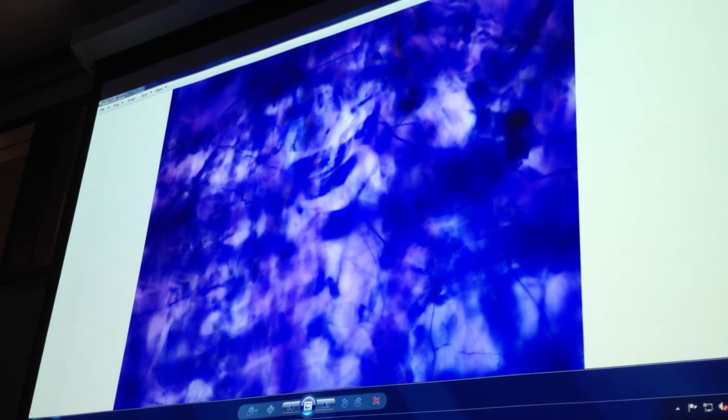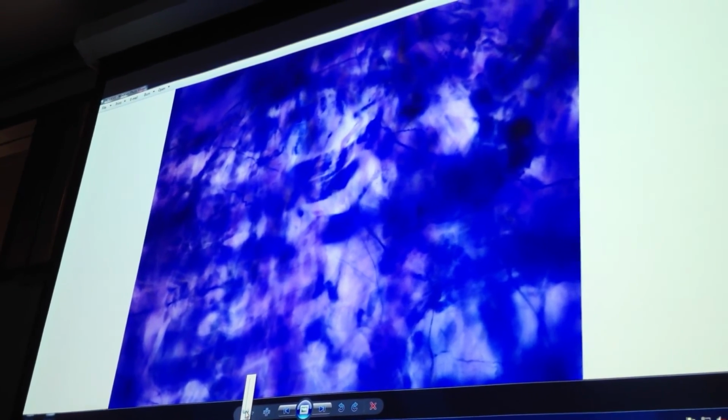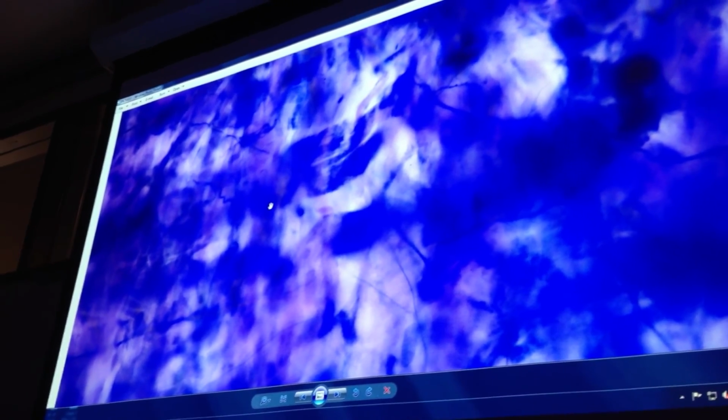We looked at this at the first, it's a little bit different. This is another connective tissue. Loose or dense? Loose. Regular or irregular? Irregular. Type of fiber is that one or that one? Elastin. So what's this one? Collagen. And all those dark spots are fibroblasts.